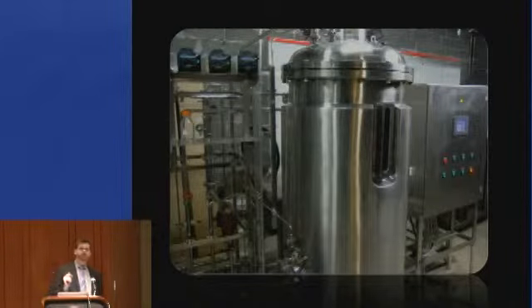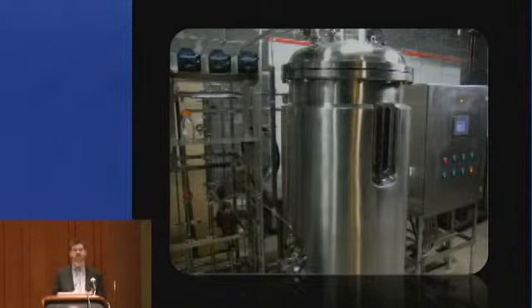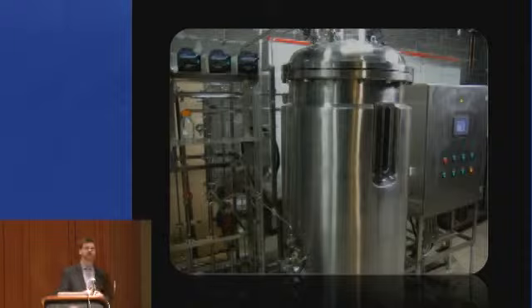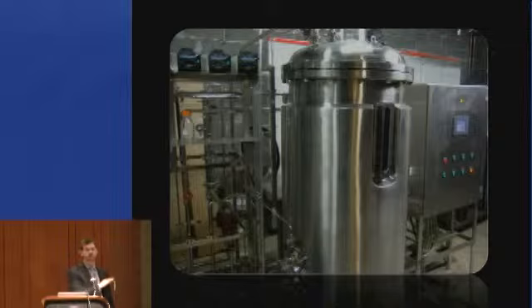Now, increasing productivity in bioprocess development typically means improving the overall reactor conditions. That is, you would formulate the media, the oxygen content, the pH, the chemicals that are present, all of these different elements you would maximally optimize in order to get productivity out of those populations of cells. In Pichia, this has been done, and currently you can get to about a gram and a half per liter using fed batch conditions that optimize as many of these parameters as you can.